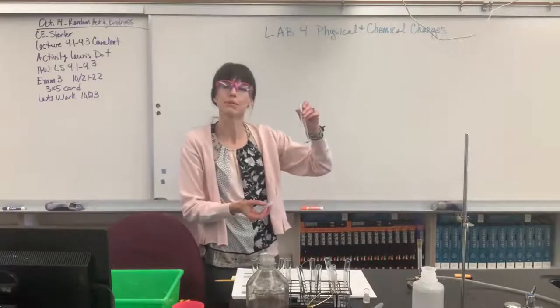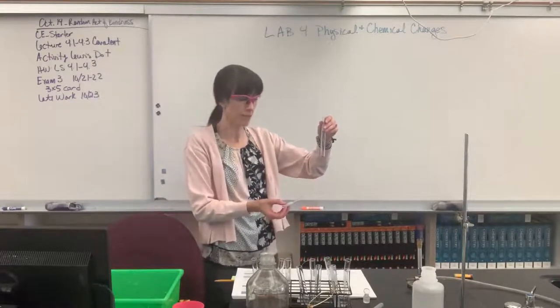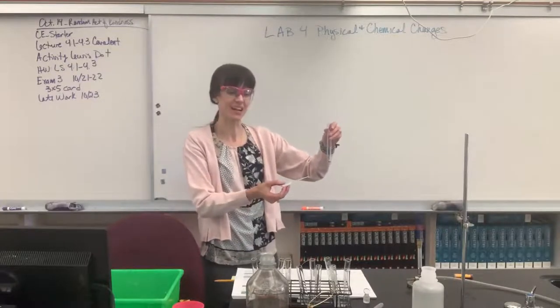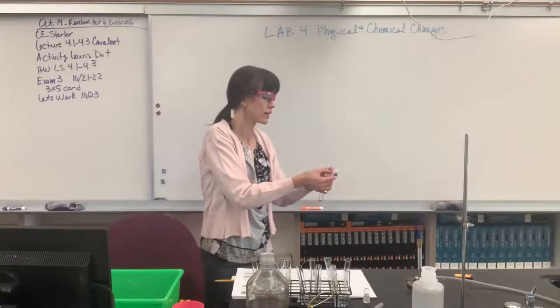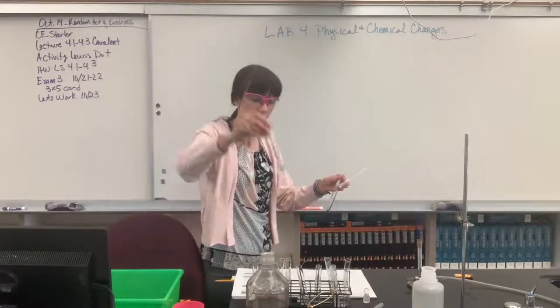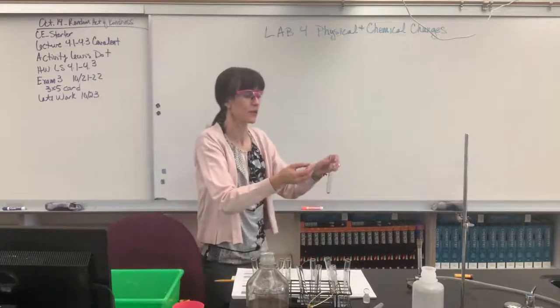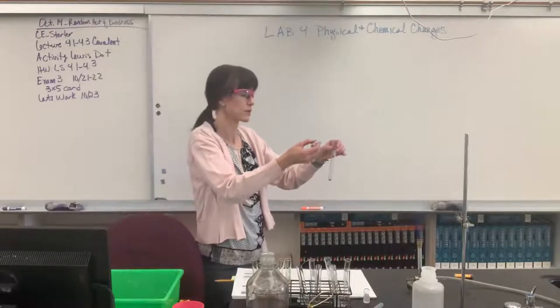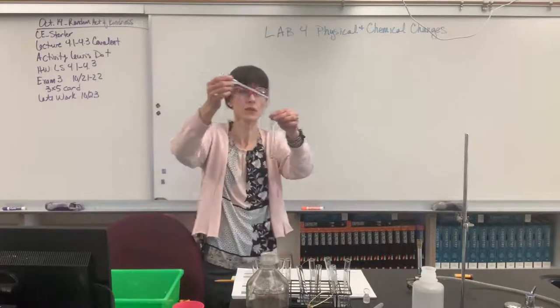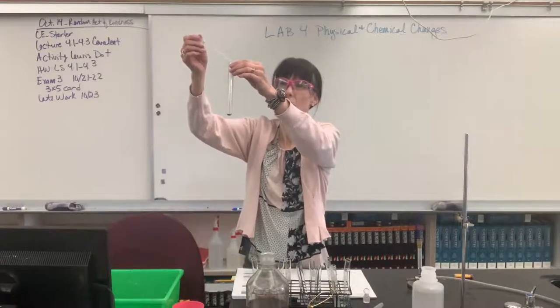It turned black when I heated it. Remember, it was that really pretty seafoam green? Well, when we heated it, it turned black. So let's add the HCl, and we're wondering, is it going to look like that beautiful green color? Is it going to match, or will it look like something different? Okay, here we go. When we heated it, did it undergo a chemical reaction and change the chemical composition? So I'll do it right here for you. Here we go. I need to be able to see it.